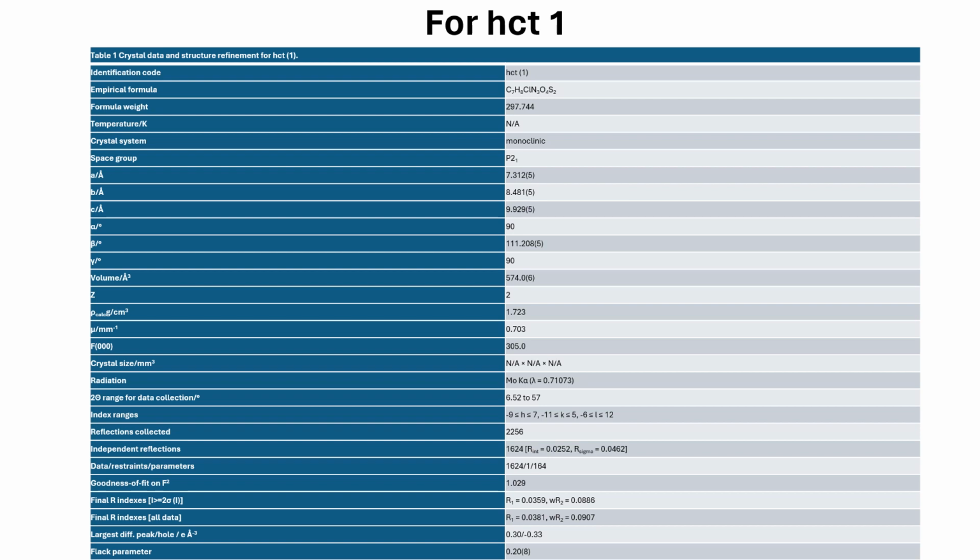Initially it was more than 10, right? Or to be very specific, in the starting it was not applicable. The R factor was saying that no values are applicable. But once I started, it showed 10, then it showed 7.3 something. Then after solving each and everything, it was around 3.78. Then again I refined it, it was around 3.56. So the lower the value, the better.